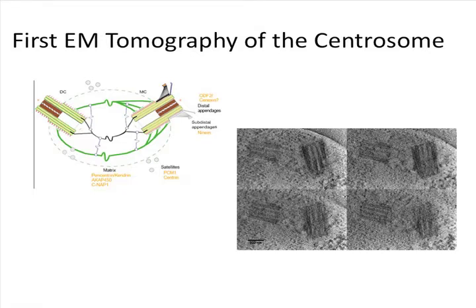Okay, so we are studying cells and we are using electron microscopy, but we have a problem. Electrons don't go through cells if they are more than, say, 1 micron thick. How many cells do we have 1 micron thick? Not too many. So if we want to study really normal cells, on which we can pose a number of interesting questions, we have to invent another microscopy.